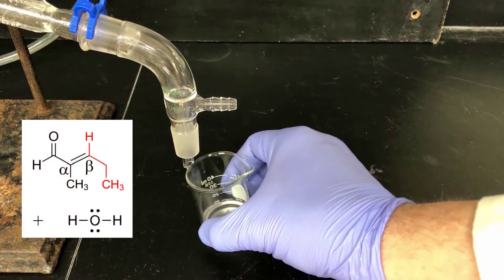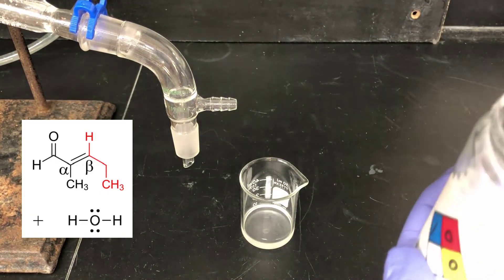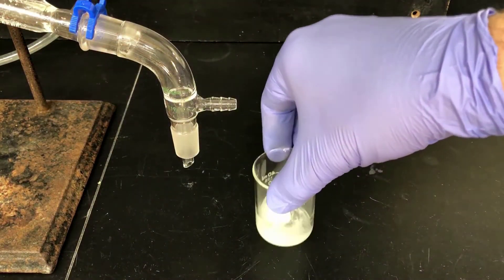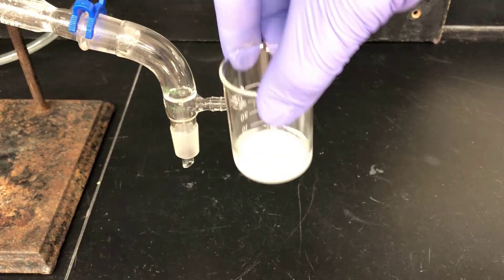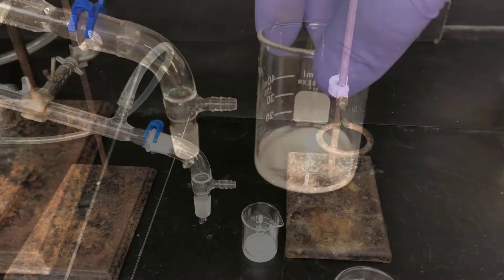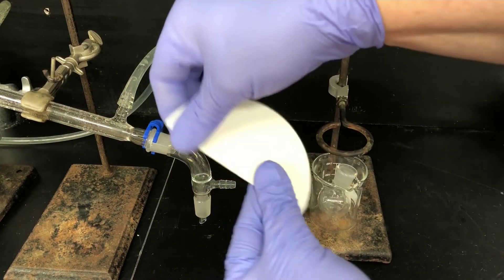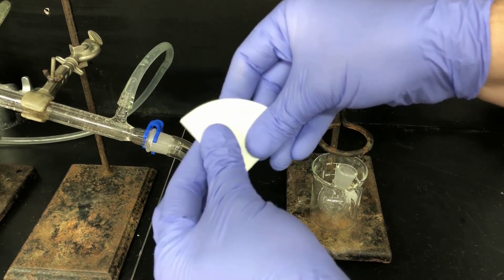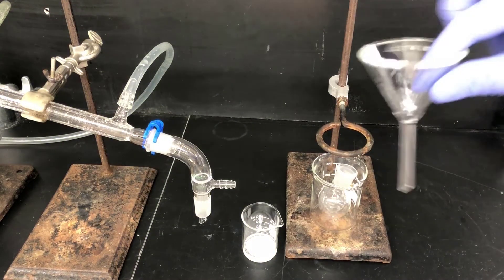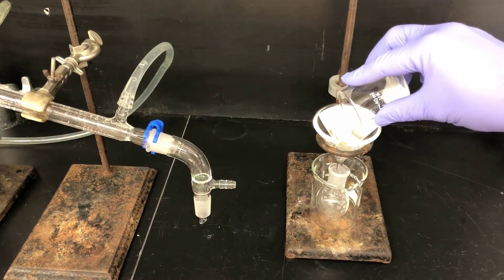Now that the distillation is complete, I have the dehydrated aldol product and water in the flask. I need to remove the water by adding magnesium sulfate — add enough to make a thin layer in the bottom of the flask and swirl it around. If it gets swirled up, you've added enough; if it's all clumpy, add a little more. Now it's time to filter the product to remove the drying agent. I'll fold a piece of filter paper into a cone, put it into a funnel, and filter the material into a 25 milliliter round bottom flask for the next distillation step.